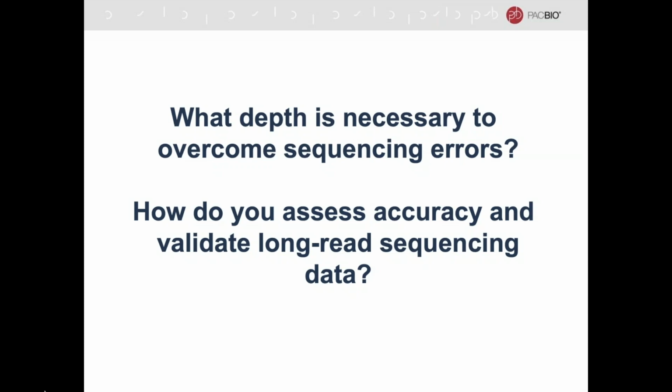I can move almost directly to the assembly step and say, well, I don't need to loosen that threshold for aligning these things for error correction. I can set a very strict threshold that would exclude subgenomic sequences in the first place.